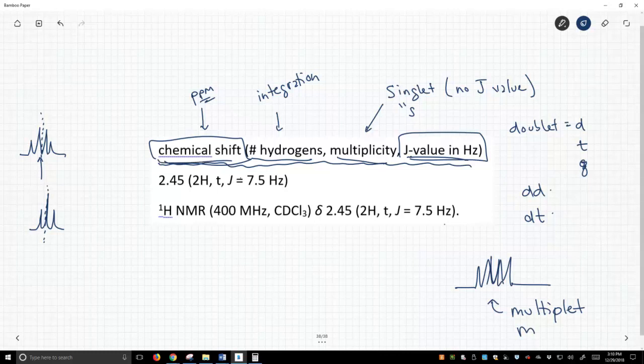What is the chemical shift for a multiplet? Well, since there is no real center to this peak, you simply say the multiplet starts here and it ends there. So you report a range of shift values. That multiplet runs from 7.42 to 7.29. So a multiplet is a range where the peaks show up.